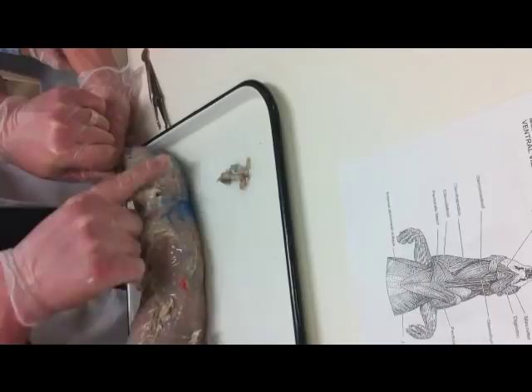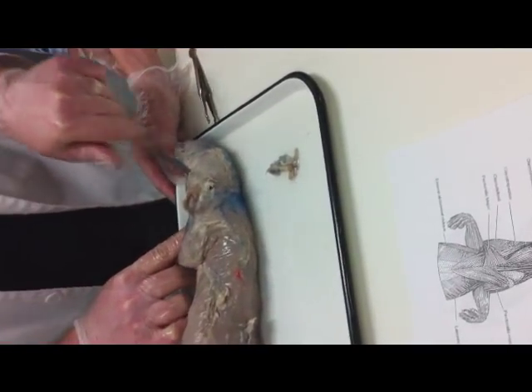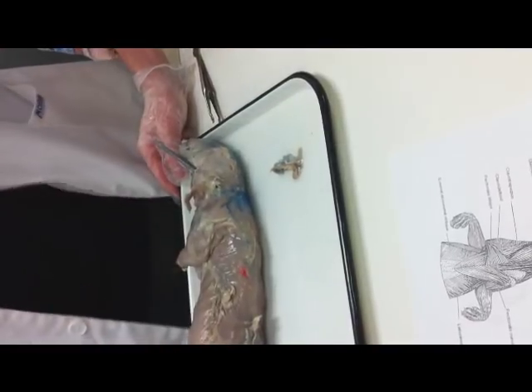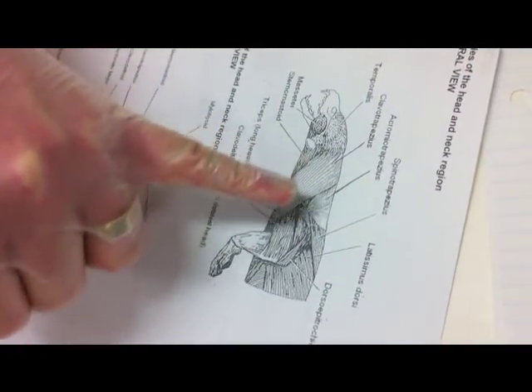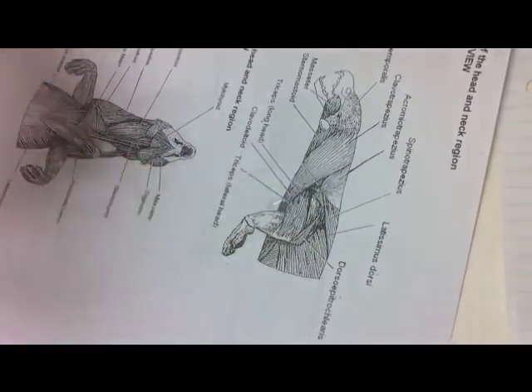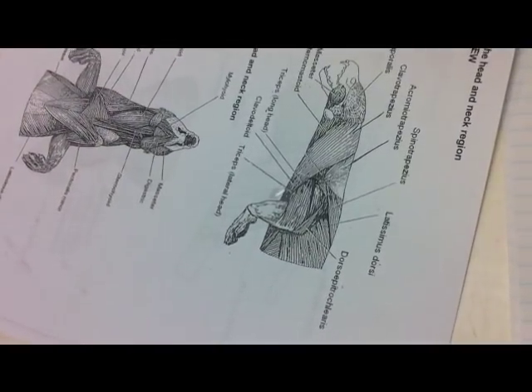So there's my clavotrapezius. Now, the trapezius muscles are the ones that are on the tops of your shoulders, your traps. They make guys look triangular, right? And what you've got is your clavotrapezius. There's one right over the leg called the acromotrapezius, and one that goes back towards the spine called the spinotrapezius. So this is the clavotrapezius.